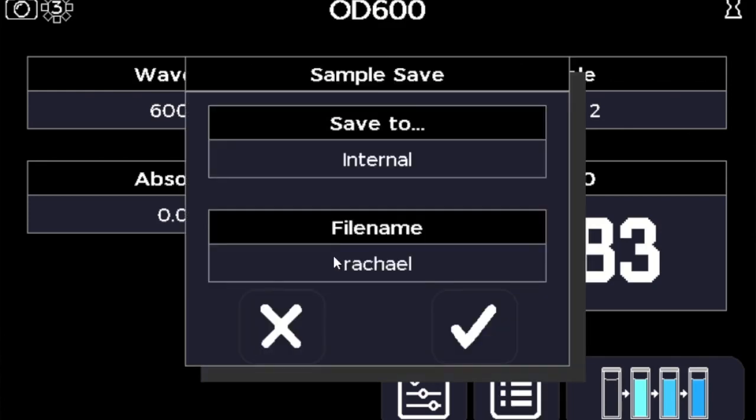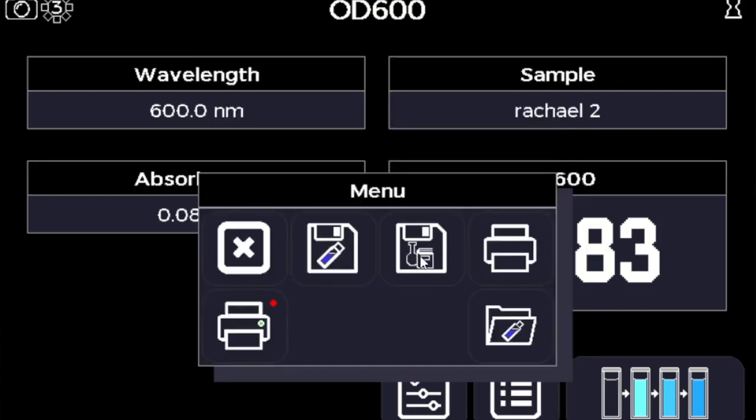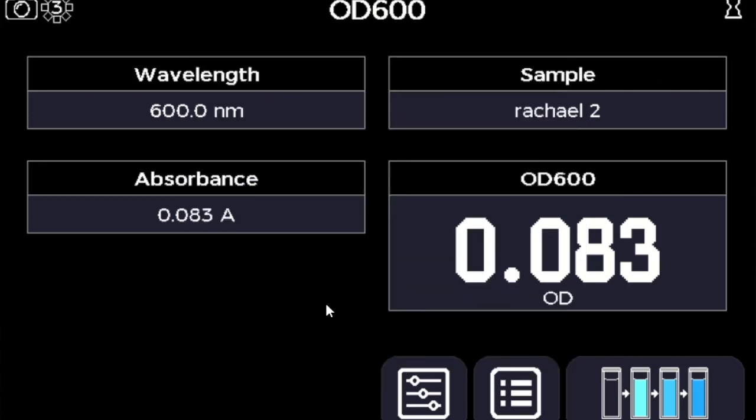You can save your results — it's very important to have multiple options to save these things — or you can even go back and save your method if you decide it's something you want to use again and again.